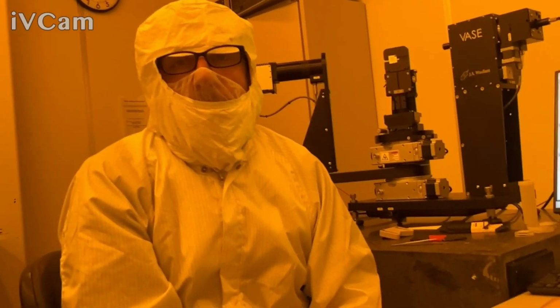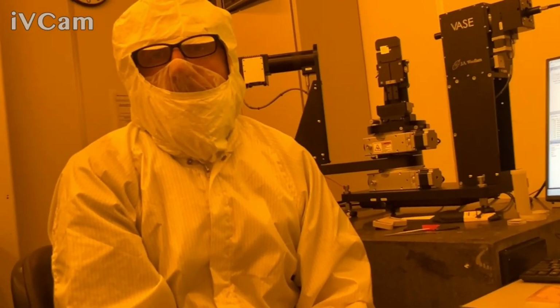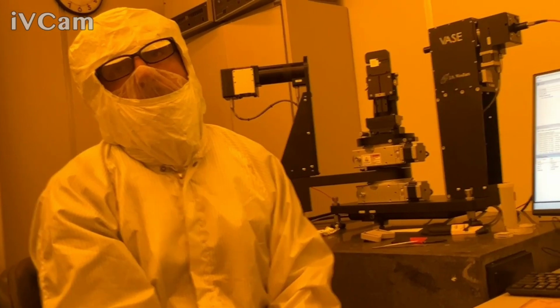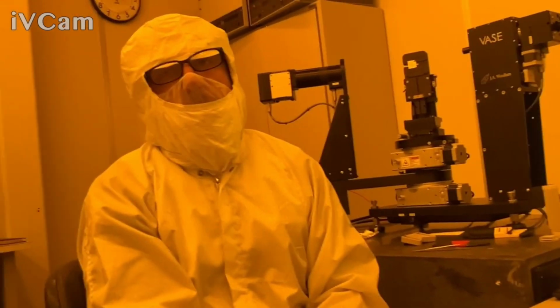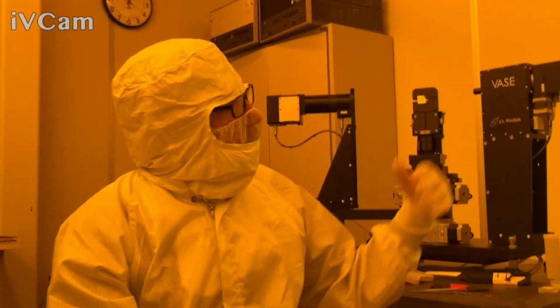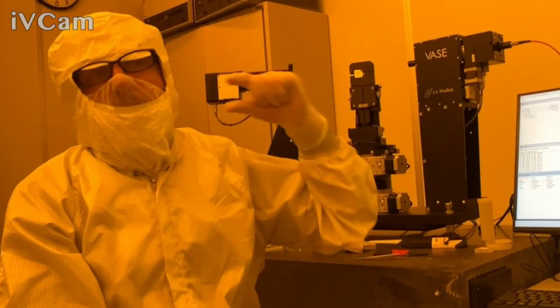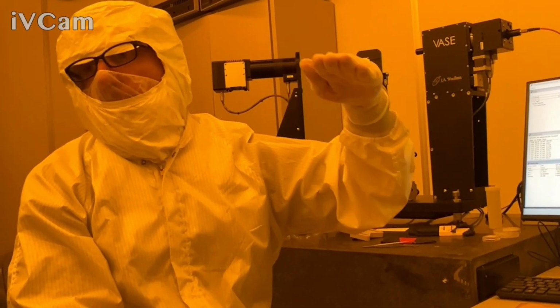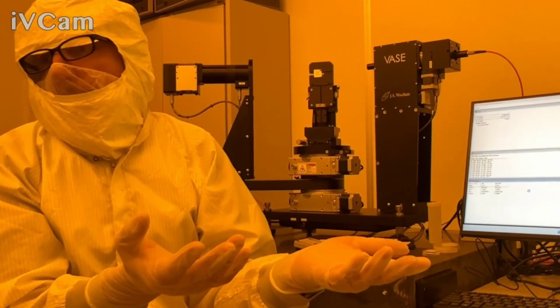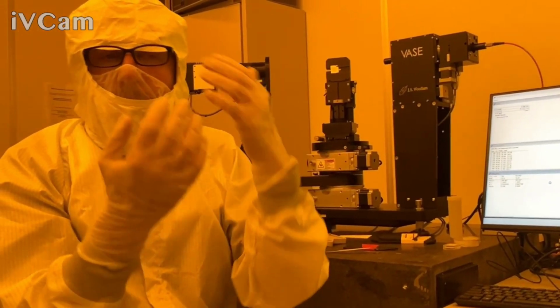The problem with these films is it's not just the surface roughness, right? Because the film is porous, yes, porous, and the pore sizes are large. Then the roughness is going through the whole bulk. It's not just a surface condition. Right, it's not just a surface condition. So when ellipsometry is doing this optically, it's literally just adding a surface layer of lower index. If you add typical optical roughness, that's essentially what it does to the optical contrast, or optical properties.